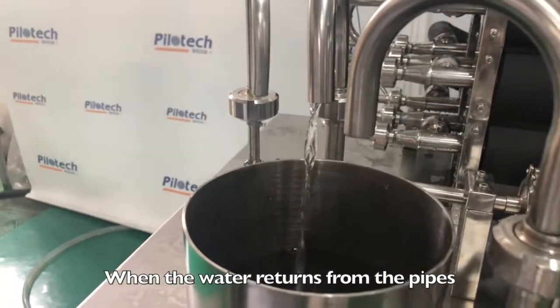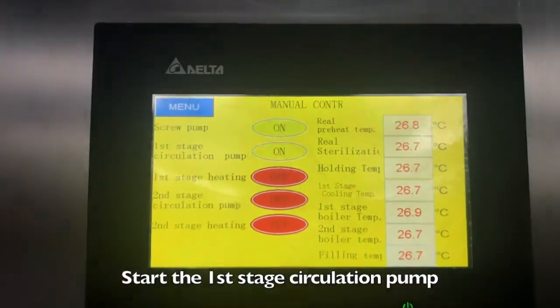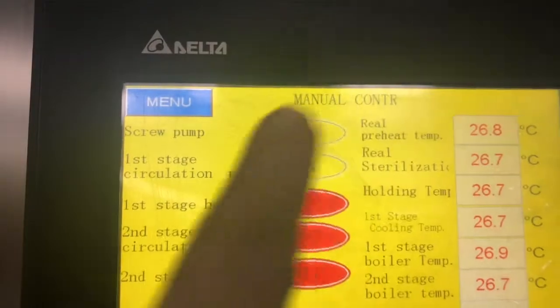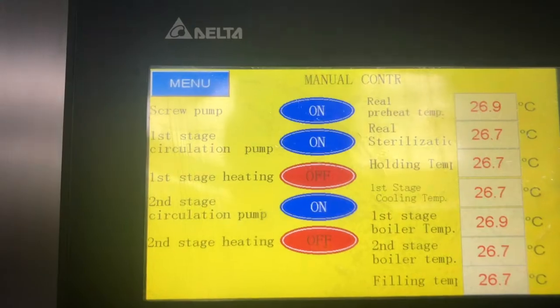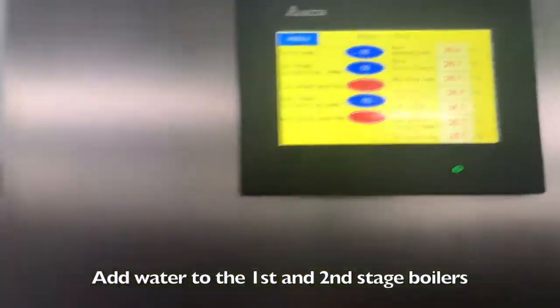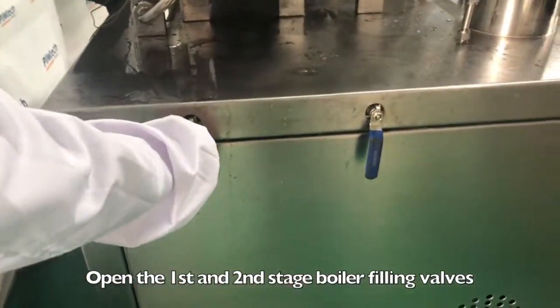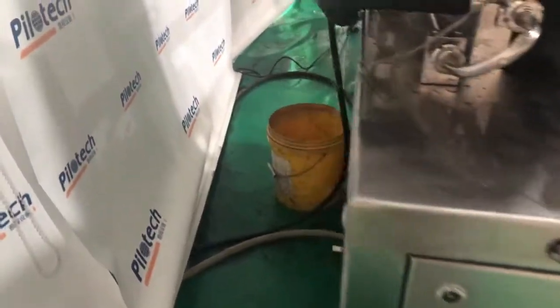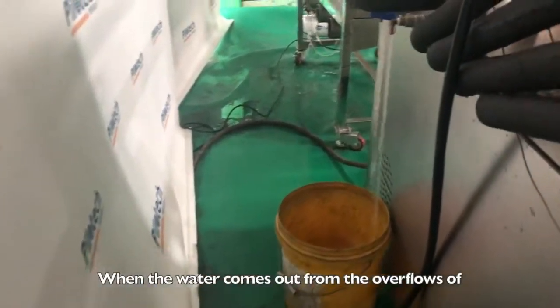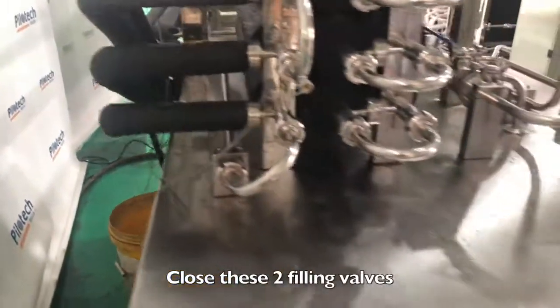When water returns from the pipes, start the first stage circulation pump, then start the second stage circulation pump. Add water to the first and second stage boilers by opening their filling valves. When water comes out from the overflows of both boilers, close these two filling valves.